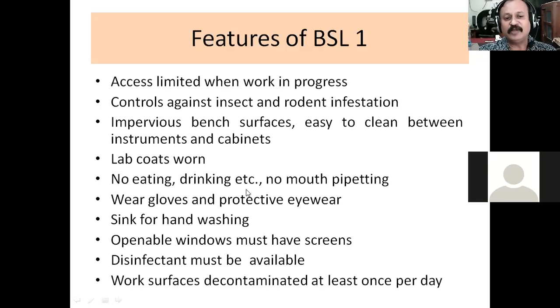Okay. And then your teachers might have told you not to eat or drink water in the laboratory. So this is very important. And you are also not supposed to do mouth pipetting. I do not know whether you were doing mouth pipetting in the laboratory, but the laboratories in the colleges are not very well equipped, I know that, and you might have been required to do mouth pipetting at certain times. But usually, when it is biosafety level 1, then you are not supposed to do mouth pipetting. You are supposed to use the pipette men instead.